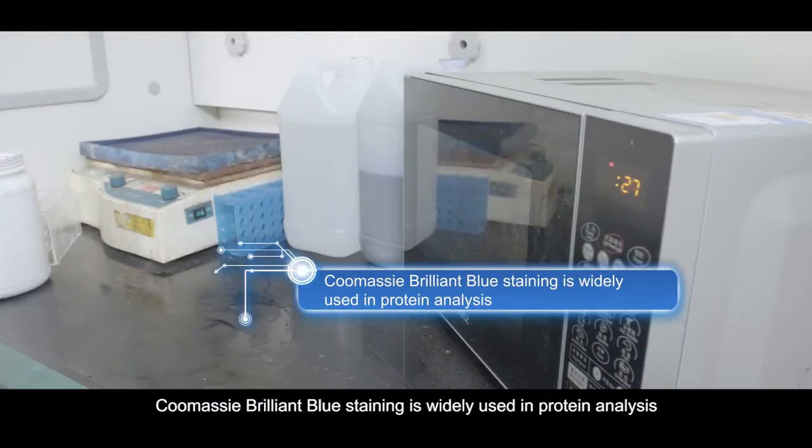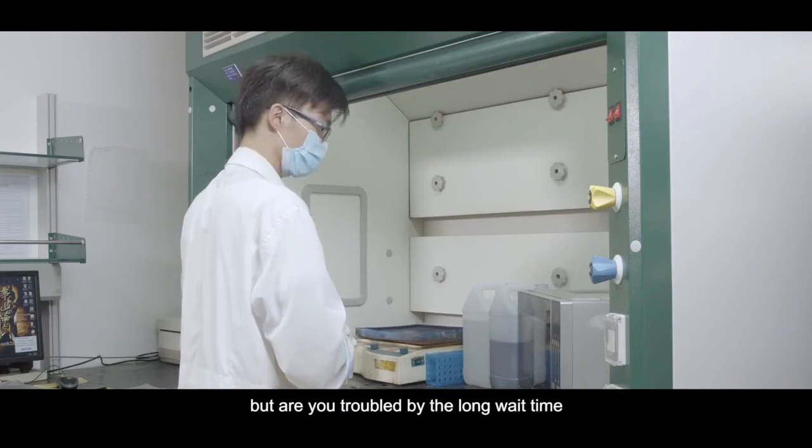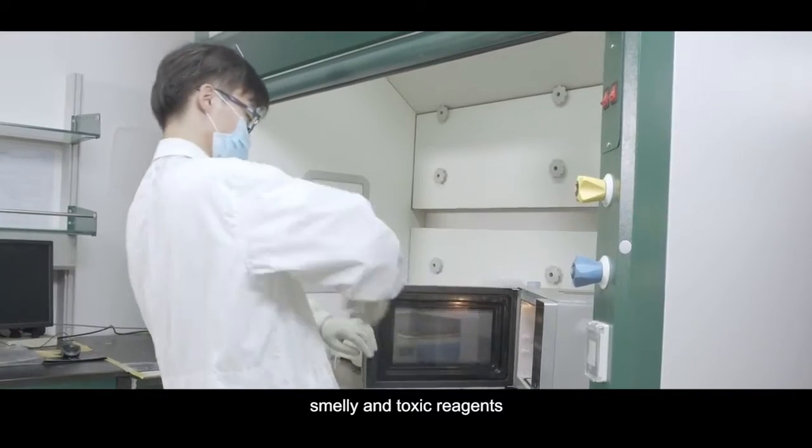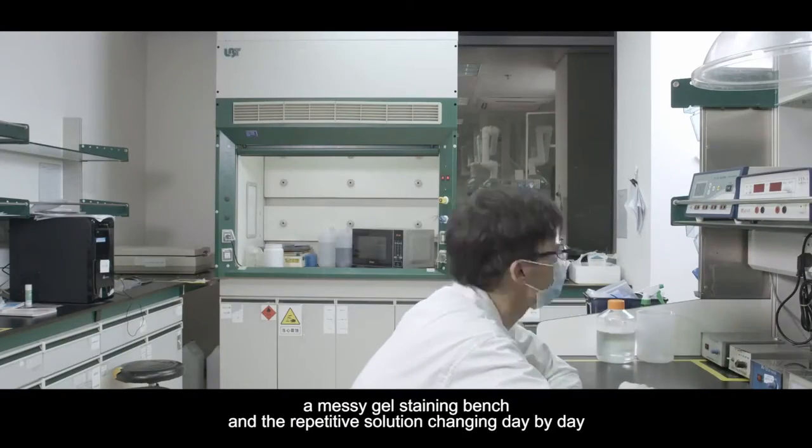Coomassie Brilliant Blue staining is widely used in protein analysis, but are you troubled by the long wait time, smelly and toxic reagents, a messy gel staining bench, and the repetitive solution changing day by day?